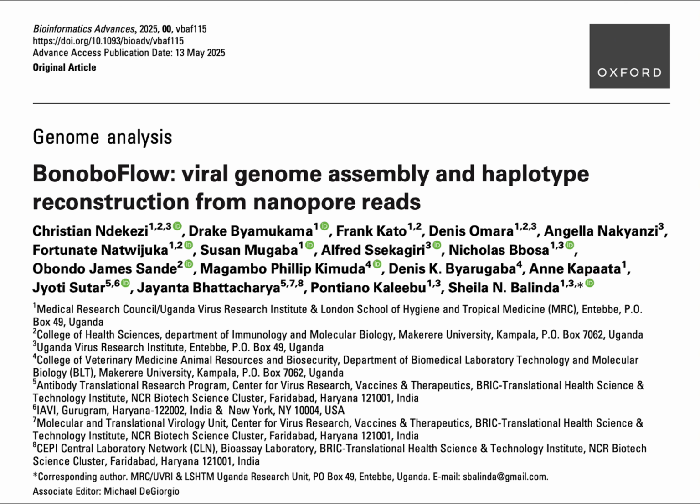So its core purpose is high accuracy base calling, robust error correction, proper genome assembly, and that detailed haplotype reconstruction. It even ensures the final output is reliable by correcting reading frame issues in the draft assemblies. Reading frames. Making sure the genetic code is read in the right groups of 3. Precisely. So the whole process becomes much more reliable and robust from start to finish.